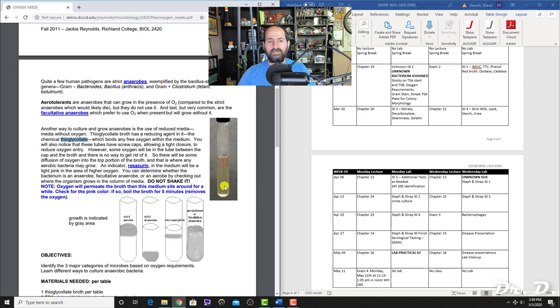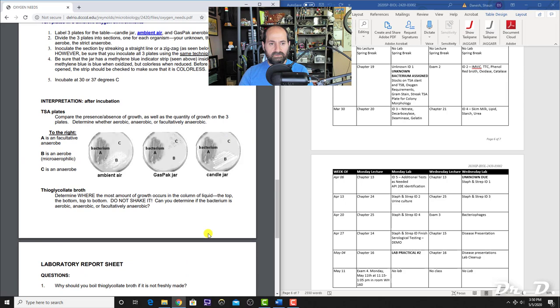In the thioglycolate tube: bacteria that grow throughout are facultative anaerobes; bacteria that only grow near the top are microaerophilic; bacteria that grow only near the bottom are strict anaerobes; bacteria that grow only at the very top are strict aerobes. At the bottom there is the least oxygen, and at the surface there is the most.